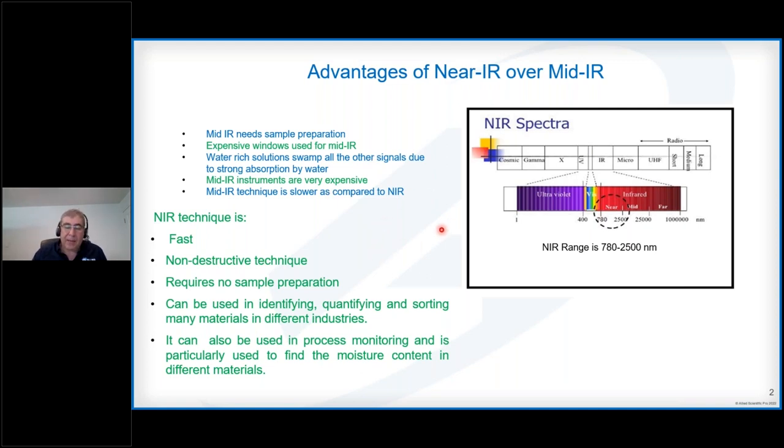For NIR measurements, it's a fast, non-invasive process that doesn't require sample preparation, and it can be used for identifying and sorting different materials and for process monitoring. But the downside is you need to analyze the spectra more in detail compared to mid-IR.